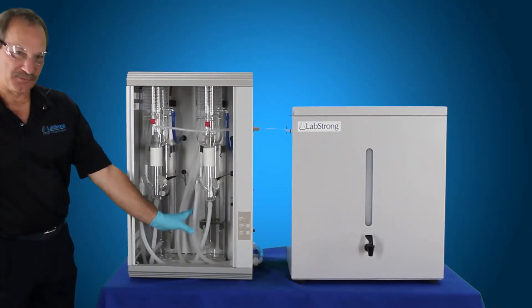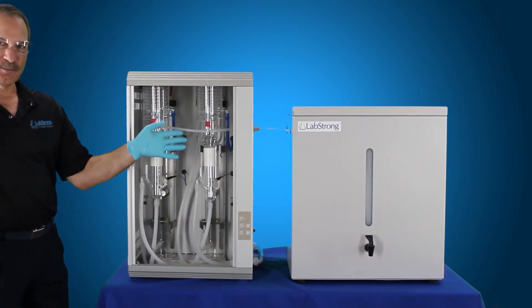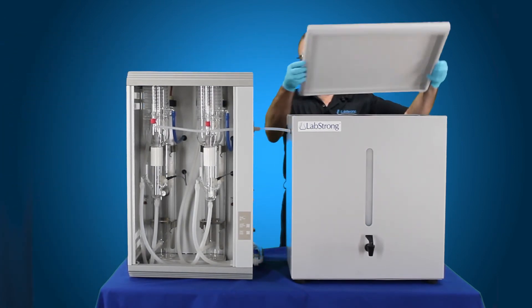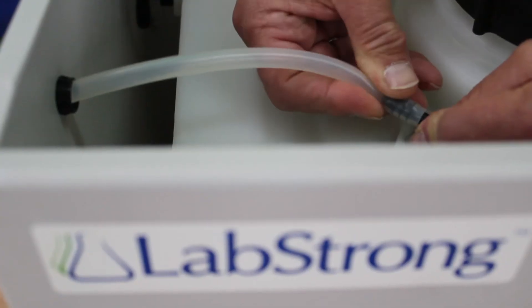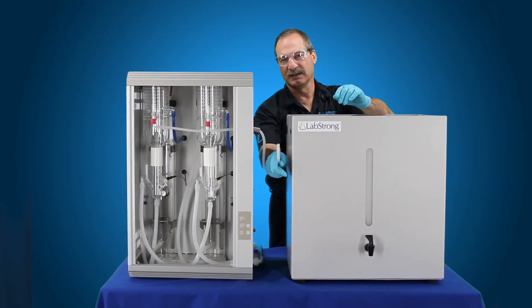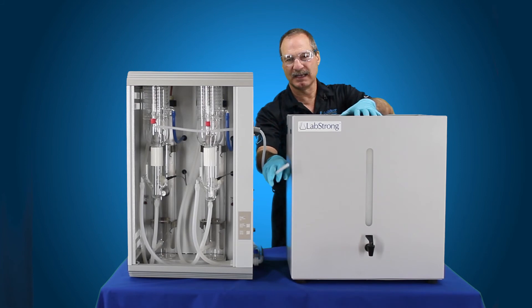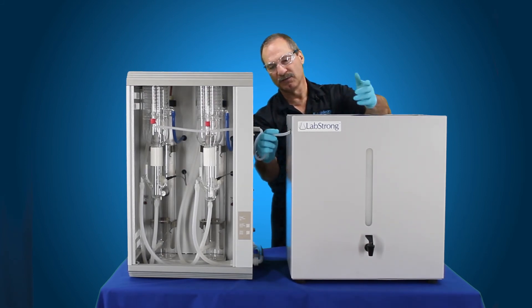Now that we've actually gone through the two flushes, we're going to go ahead and start the still back up. Before we do that, we need to go ahead and disconnect our distillate tube, pull the cover off the tank, disconnect our distillate tube to the tank, and we want to run this to drain. So about 10 to 20 liters of water run to drain — your first 10 to 20 liters that you're going to be running this unit, you want it to drain.